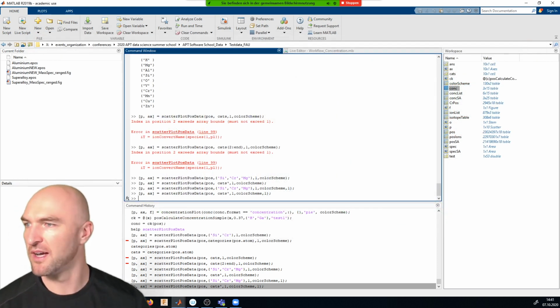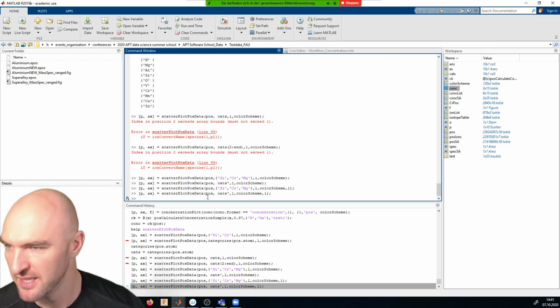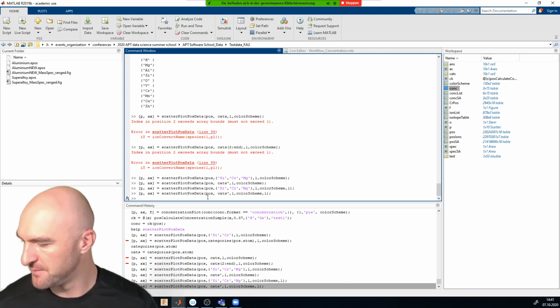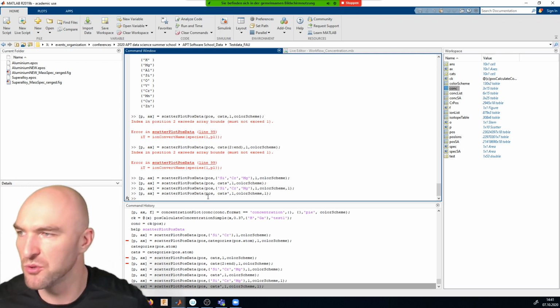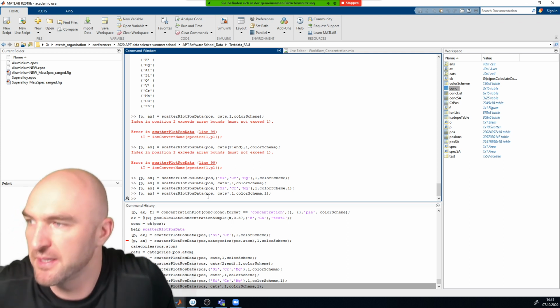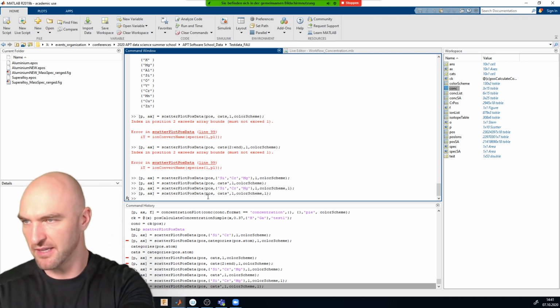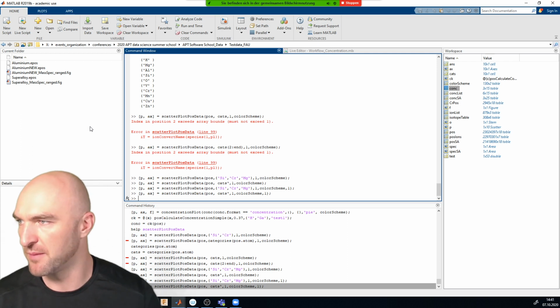Okay, so the concentration session is obviously one of the simpler ones because we're only calculating simple concentrations. But we still have 20 minutes left in the session. And I think in this case it would be very good to go back to see where people got stuck, and maybe take it up there again and revisit any problems you've come across.